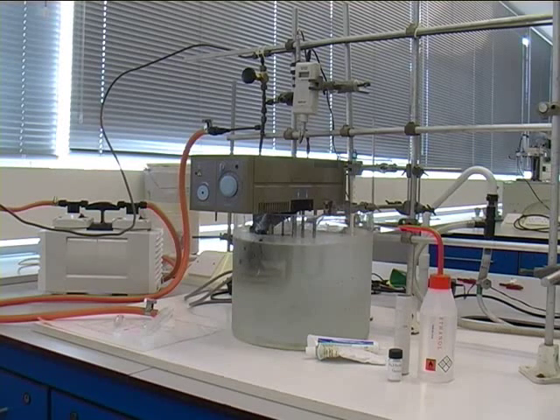The aim of this experiment is to evaluate the enthalpy of vaporization of ethanol. This will be achieved by making measurements of the vapor pressure of ethanol as the temperature is varied.